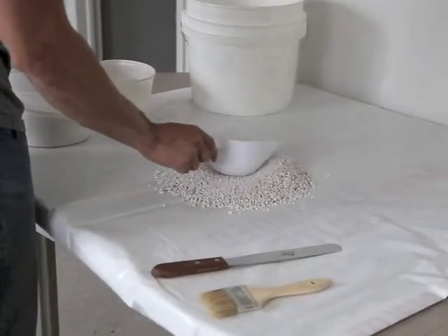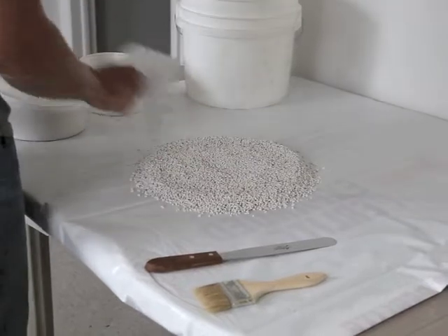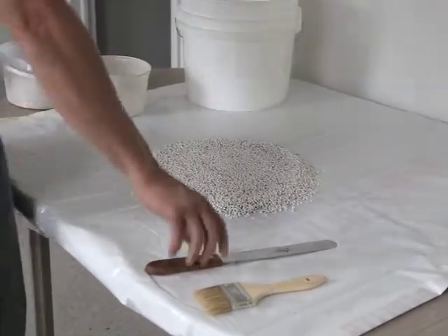Spread the perlite in a circle and to a uniform thickness by gradually widening the circle with a shovel or scoop.